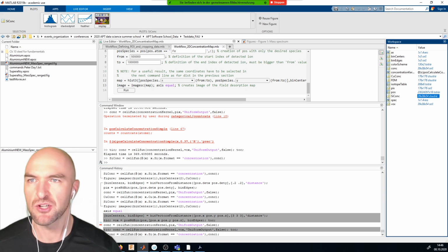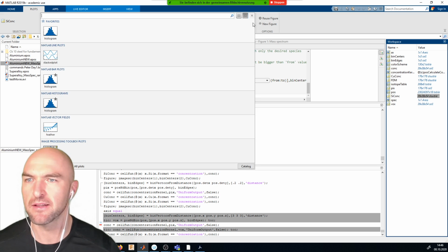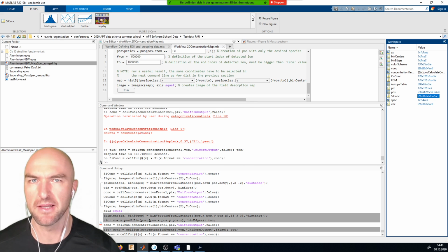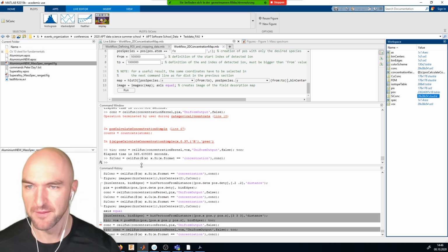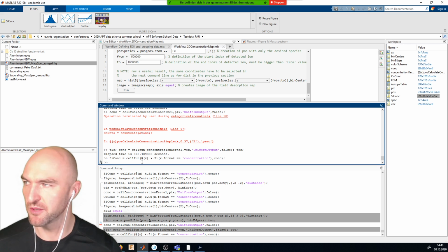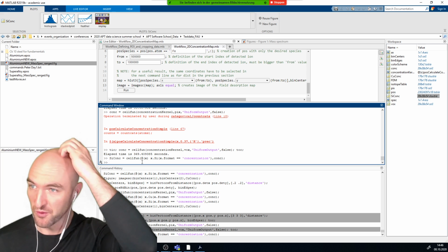And I can actually go and... this version of MATLAB does not have the volume viewer. I am very concerned. Anyway, we'll do it without the volume viewer, because that means that some of you won't have it either.